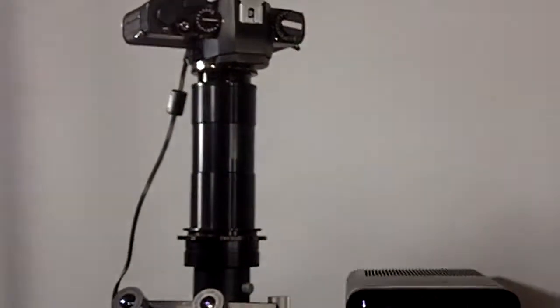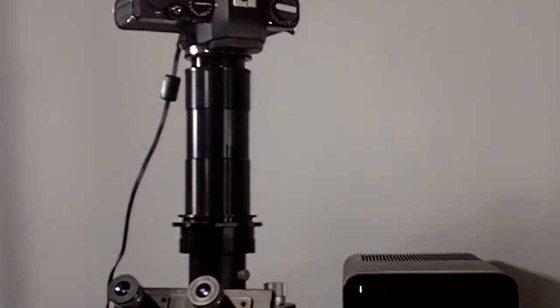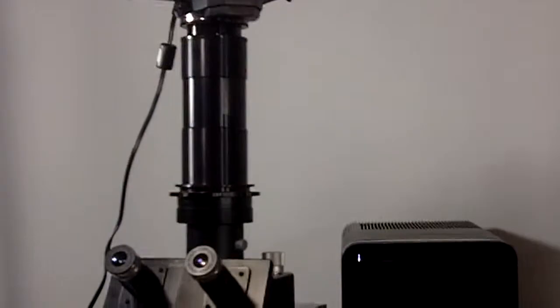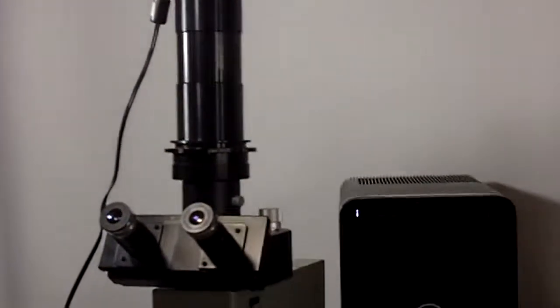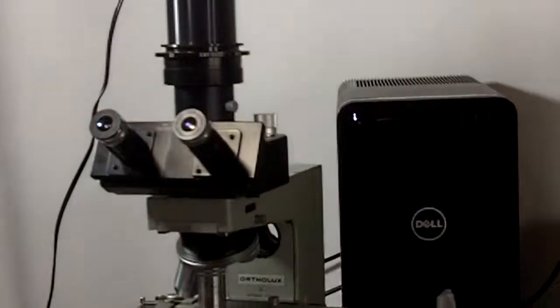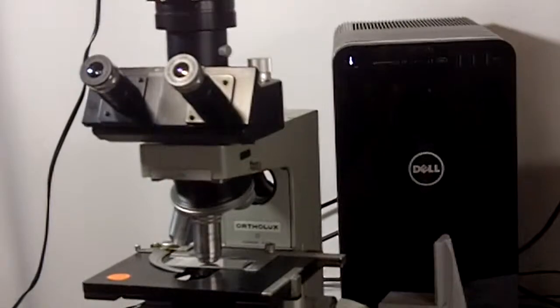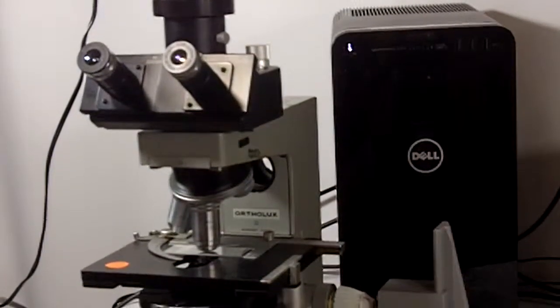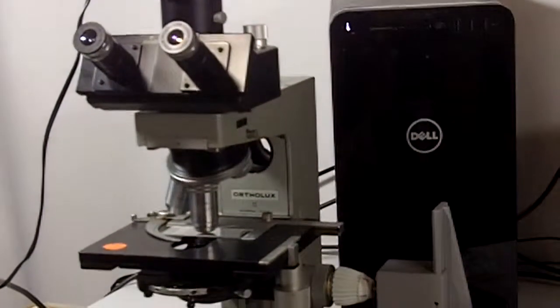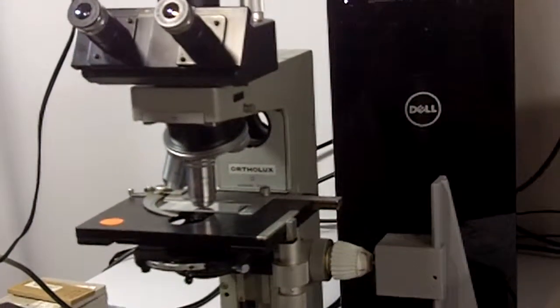It's a film camera, not digital, but it illustrates the cable going in to control the shutter, whether that's an electronic camera, either a DSLR or mirrorless.